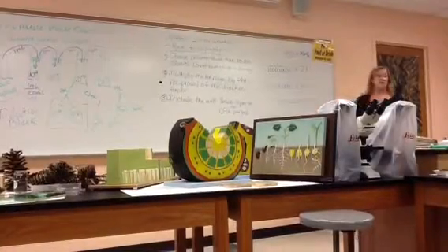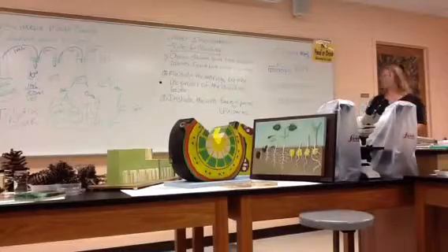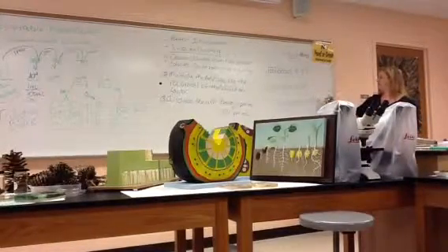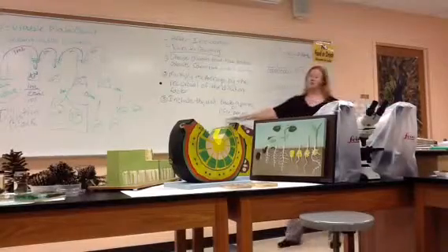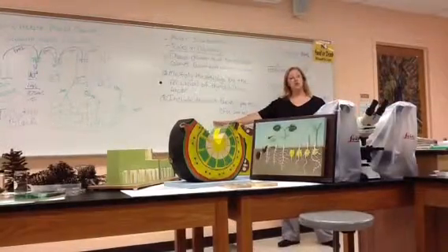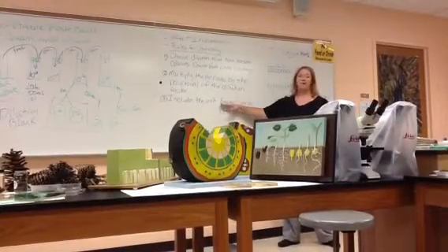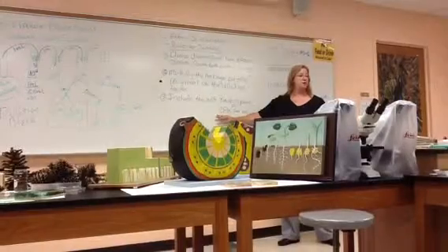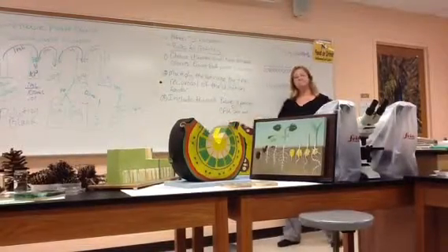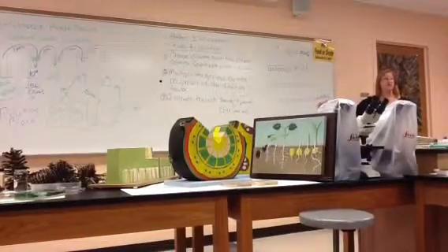But if this had been the number, 7,800,000,000, and don't forget the unit, bacteria per mil, or you could go with CFU per mil. That's colony forming unit, because you're counting colonies. So you could call it bacteria per mil or CFU, colony forming unit per mil. But you have to put a unit there, that's part of your answer.